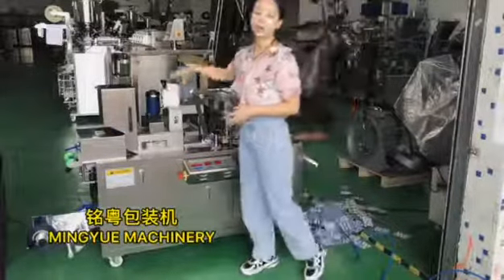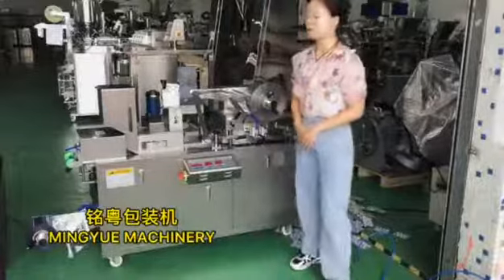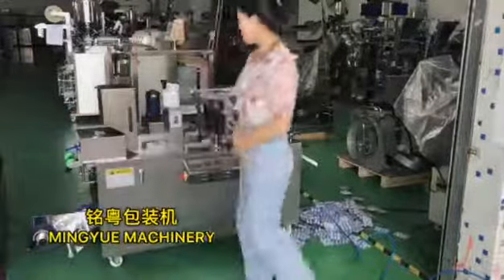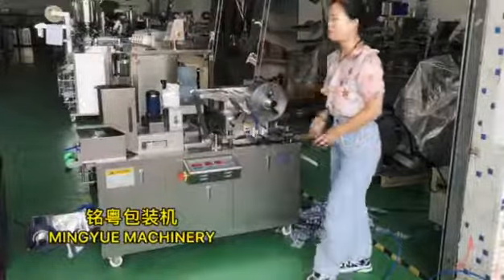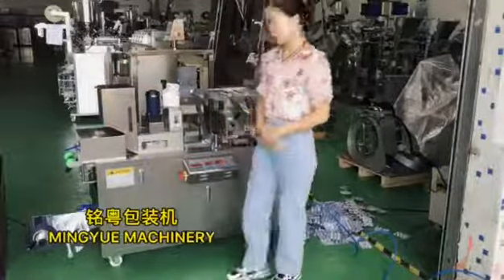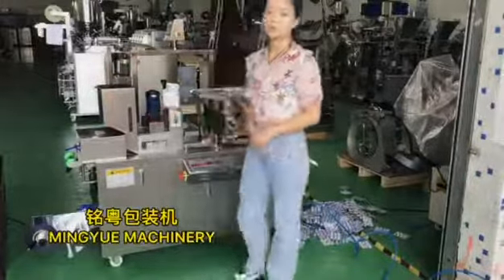Today I would like to show you how to operate our release-packing machine. First, we need one row of PVC film, another one row for aluminum foil. After we put capsule or tablet in the hopper, then we need to connect the power and the air compressor with water.